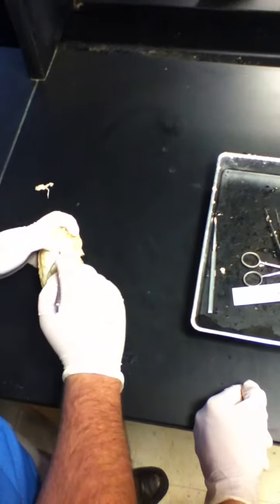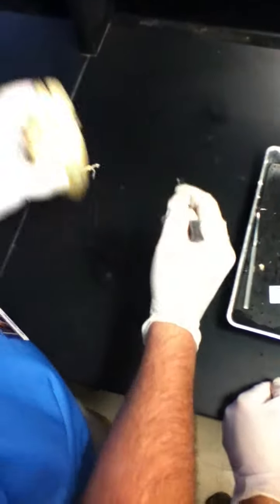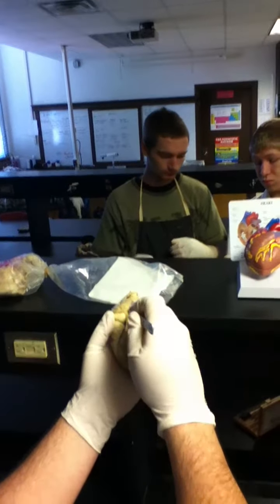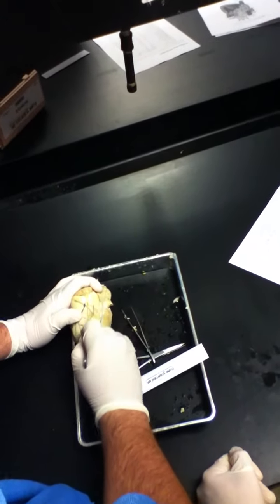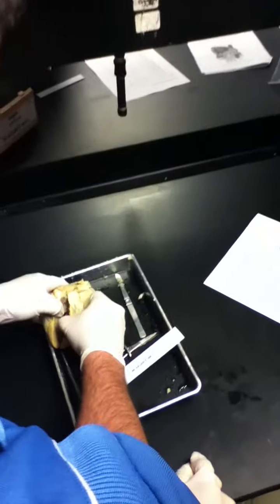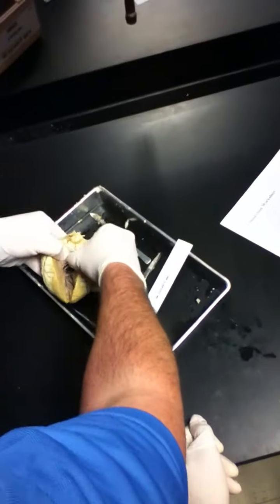Okay guys, you can go ahead and start cutting yours. Basically, you want to cut it - find this auricle right here. Anybody see that? That piece - you're going to start right up underneath it and go down. Probably a good idea to put it in your tray so you don't cut your hand. The fat just peels off, it's going to be a lot easier. I think you need to sharpen some of your scalpels. Here's the bend open.